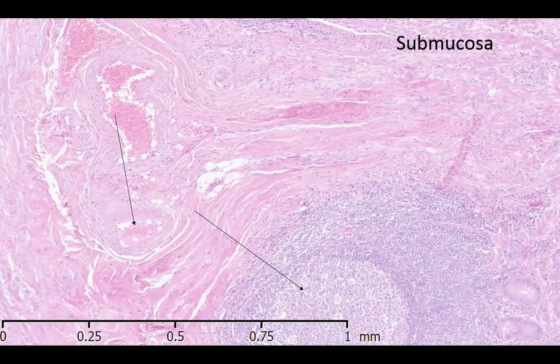Now you can see that we shifted to the next layer of the appendix, which is the submucosa. This layer demonstrates abundant lymphoid tissue with lymphoid nodules and aggregates. These lymphoid aggregates are thought to produce IgAs, which help to assist in handling toxins within our gut.